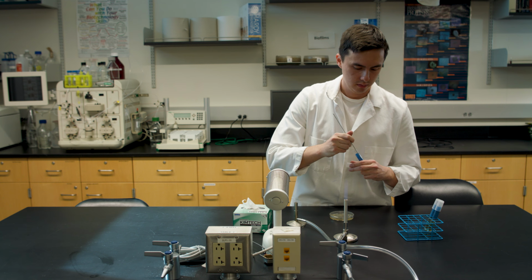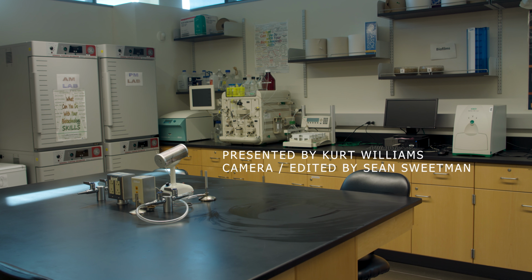Reinsert your loop into the incinerator for 7 seconds to re-sterilize and store in a proper fashion. You may now incubate your organisms in an incubation chamber as directed by your instructor. Finally, be sure to clean your work area once again with a proper lab disinfectant.